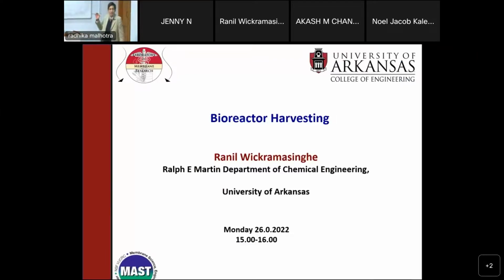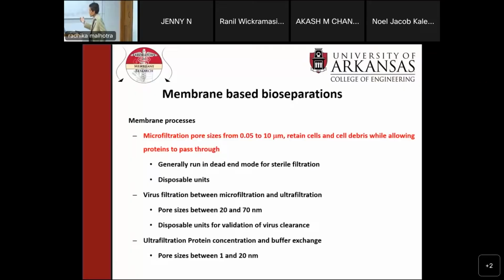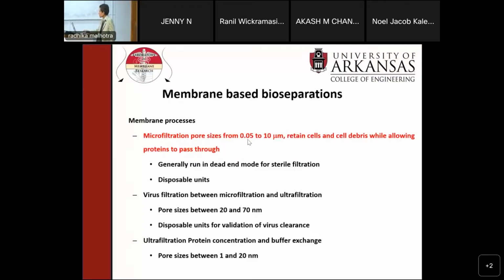As I said, in the next lecture we're going to talk about bioreactor harvesting. If you remember, that is the first step in trying to recover our product from our bioreactor. The aim is that we are going to use microfiltration with pore sizes from 0.05 to about 10 micron to retain cells and cell debris while allowing proteins to pass through.